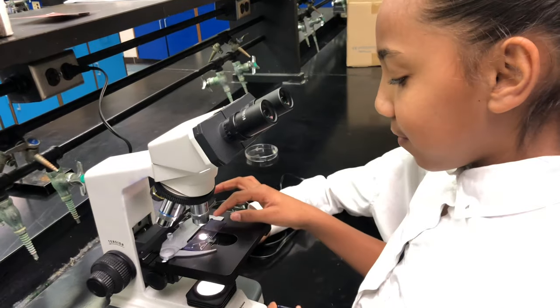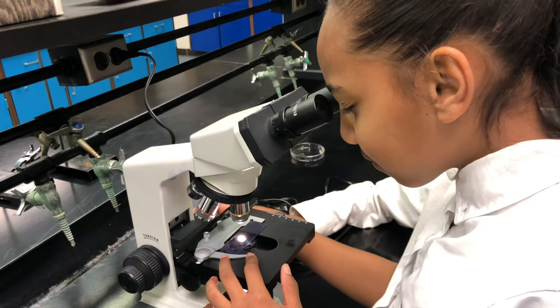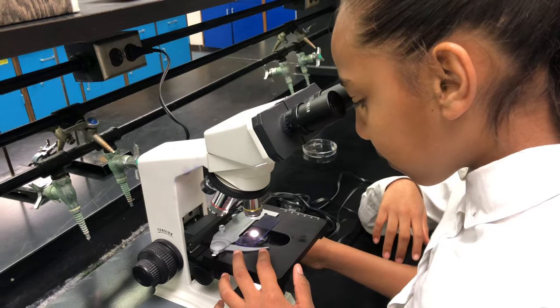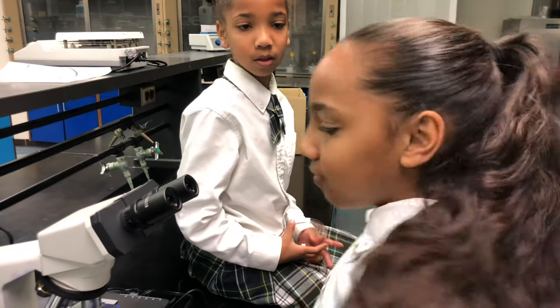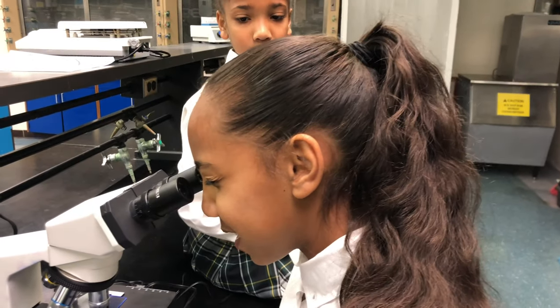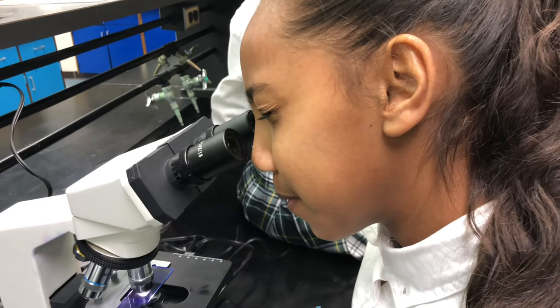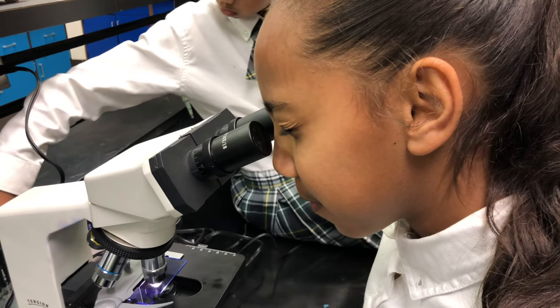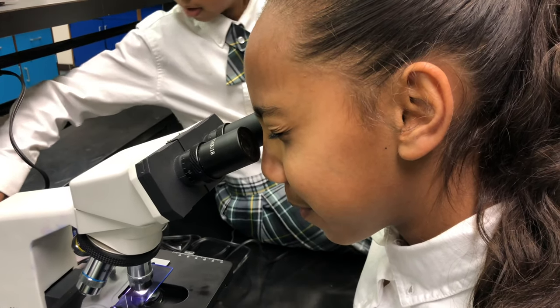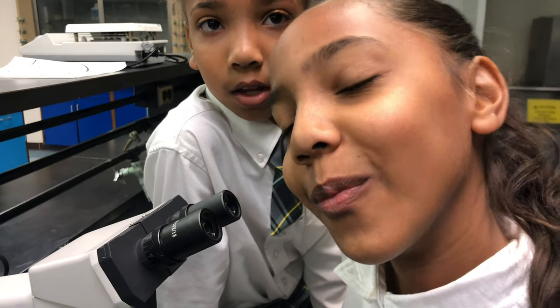Now my slide is focused — let's look at it. It kind of looks like staph to me. It's clustered, but it doesn't look like the other staphylococcus — it's not perfectly round. Maybe it's a different type of bacteria.